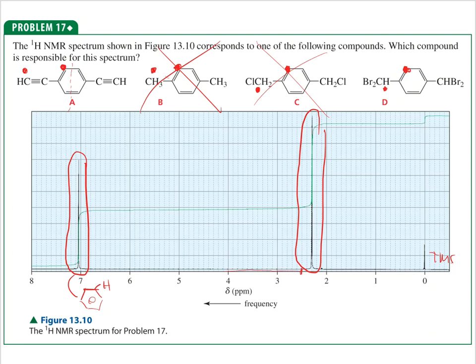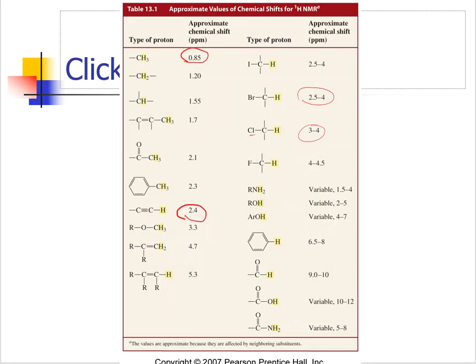And that really falls before the typical bromine type of signal does. So at first glance, I could probably say, get rid of that. And it looks like, based on the signal, that the proper choice here is going to be A, and that is a ring with an alkyne group. So that ring is the benzene ring.